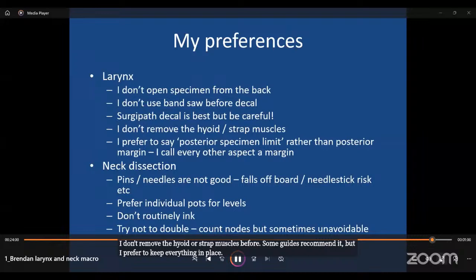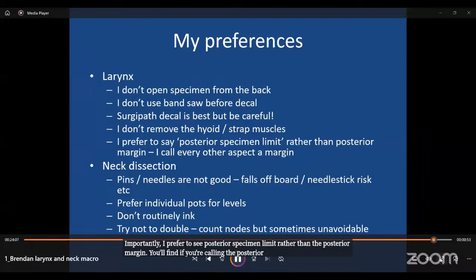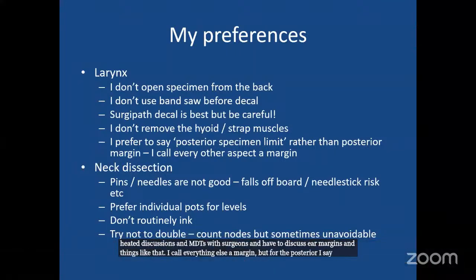Importantly, I prefer to say posterior specimen limit rather than the posterior margin. You'll find if you're calling the posterior margin, you'll get into heated discussions in MDTs with surgeons and have to discuss ear margins and things like that. I call everything else a margin, but for the posterior, I say posterior specimen limit.